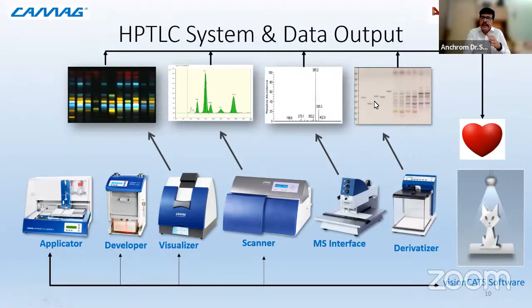If I have any spot and I just want to know its absorption maxima, I can set my system and it will tell me what the absorption maxima is. It will scan from 190 to 900, it will give me a pattern, and I will just compare it with my other component and come to a conclusion, like whether it is matching with my sample or not. So all those things are taken care of by the scanner.